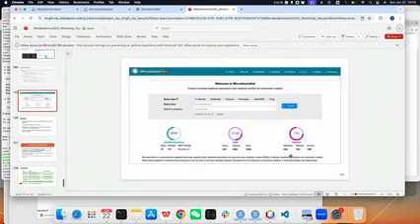Next I will go to MicrobiomeNet. This is kind of different from our other tools because it's a database tool. As we showed in the design, we have a big database of correlations, and we look into those correlations to see the details, how two microbes interact.